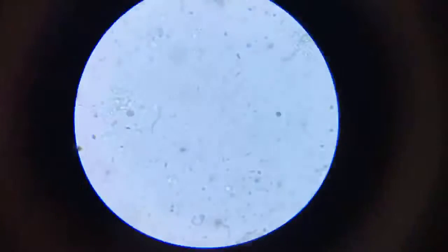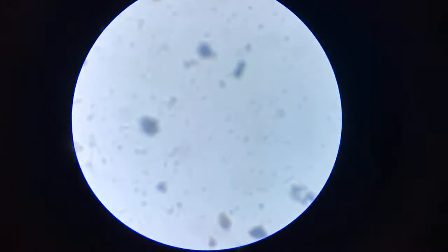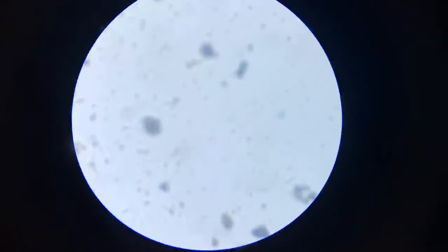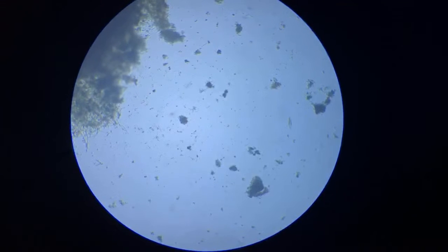Okay, I'll switch over to a lower magnification so as to find something worthy of being able to scale up. This is 10x objective, and now I'm going to 4x objective. At 4x objective, this is what we have. Let me find something.